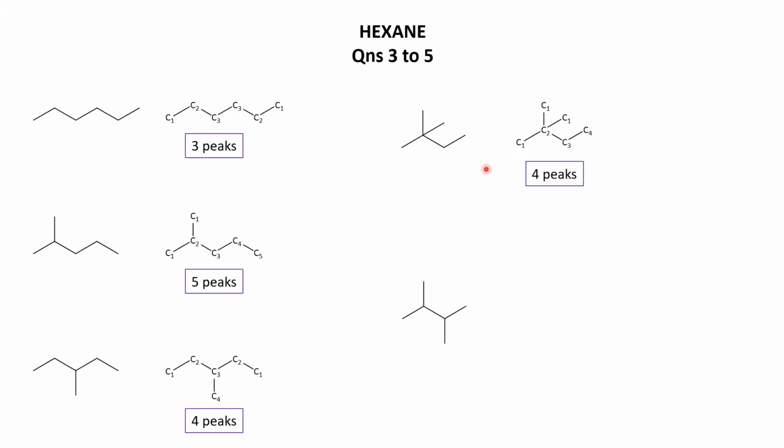So we now have 2 isomers that have 4 peaks in the carbon NMR. Might be tough to distinguish those, although I'm going to be very naughty when I get to that and break all kinds of rules in order to do that distinguishing. But before we do that, I do get ahead of myself.